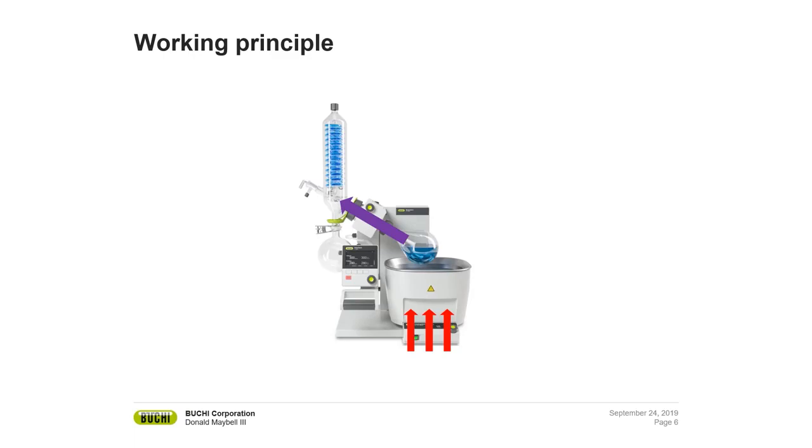The next part of the process is your vacuum. Since this is a vacuum distillation process, you pull down the vacuum to control the boiling point. By doing this, you can keep the sample at a reasonable temperature to protect your sample, and you get a nice efficient distillation process which gives you higher throughput and allows you complete control over the entire process.